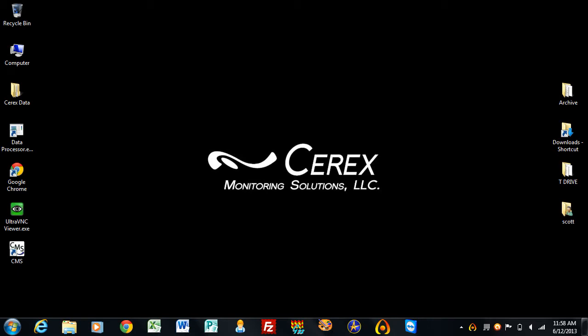This tutorial demonstrates establishing a connection with a remote Cerex UVDOAS analyzer using Ultra VNC. It also demonstrates the basic operation of a Cerex UVDOAS analyzer, alarm functionality, and data retrieval following monitoring.